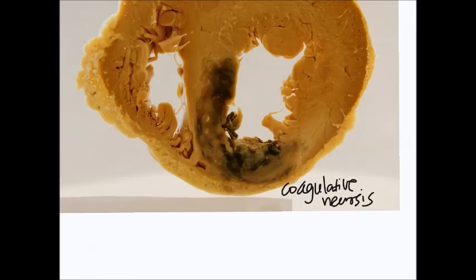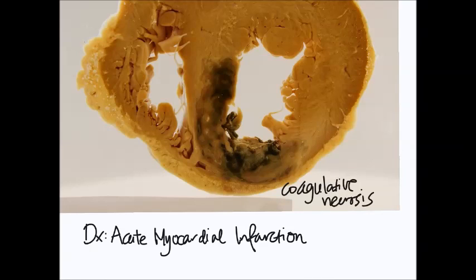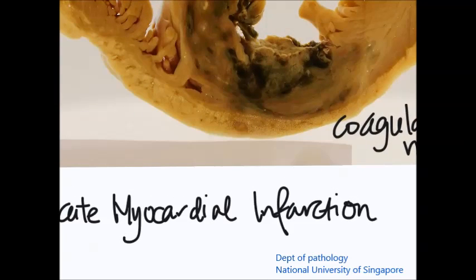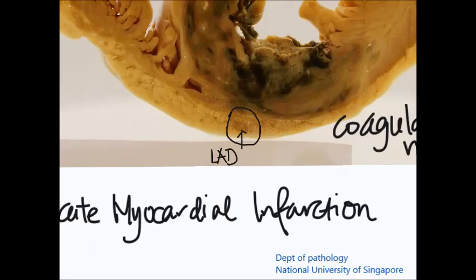The diagnosis in this case is acute myocardial infarction. Acute myocardial infarction is often due to thrombosis of the supplying coronary arteries. Looking very carefully and zooming in, we can appreciate here in the anterior pericardial fat a rounded structure — this is the left anterior descending artery, one of the coronary arteries that supplies the anterior myocardium as well as the interventricular septum. It is completely occluded, indicating thrombosis.